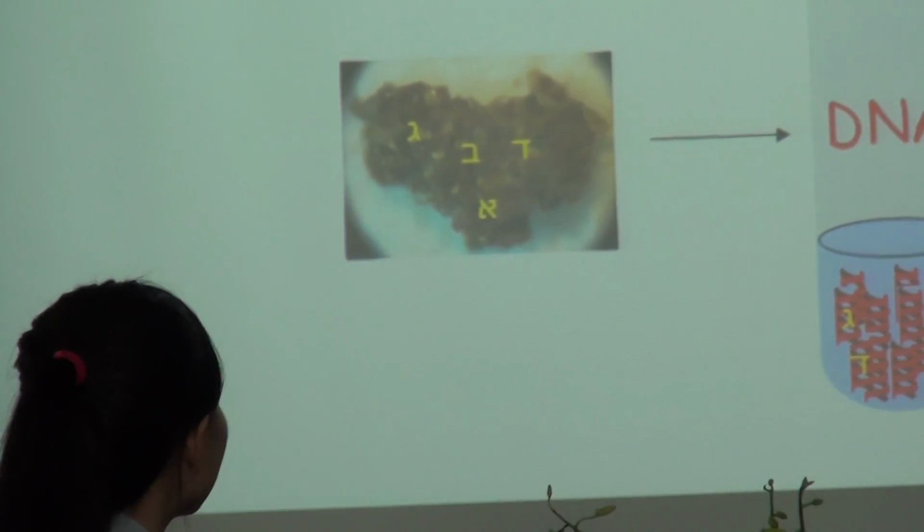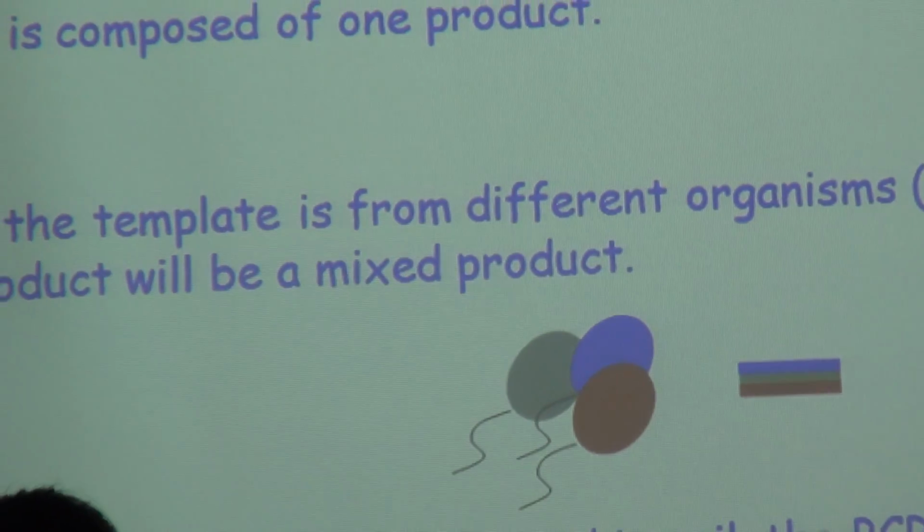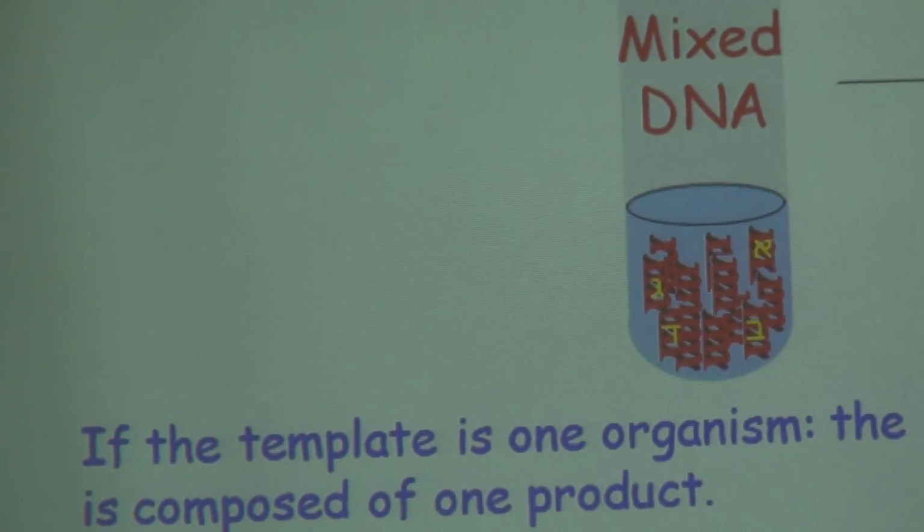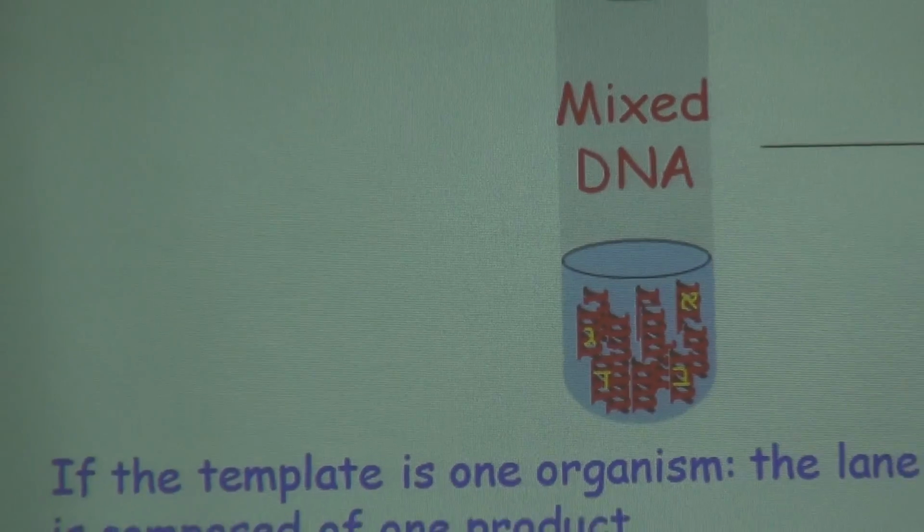Okay. Now, okay. Now, this is mixed DNA. Of course, it's not one organism. It's in this case 4 organisms mixed together.